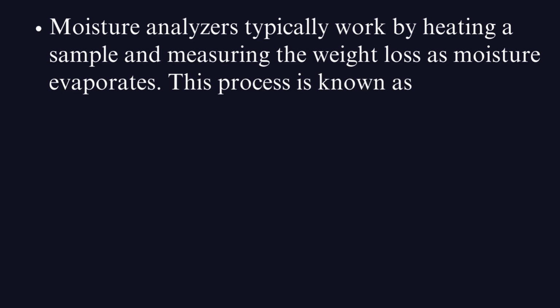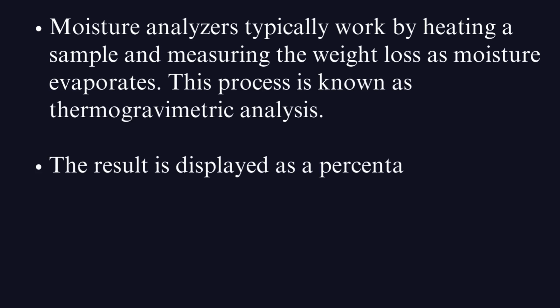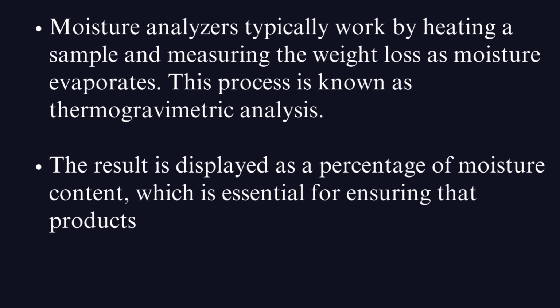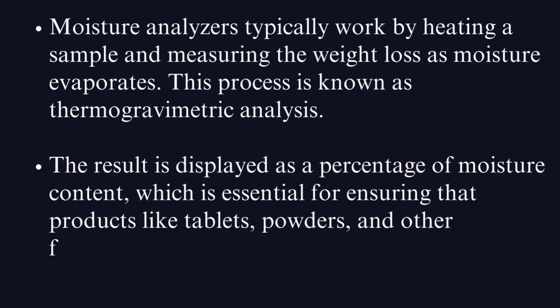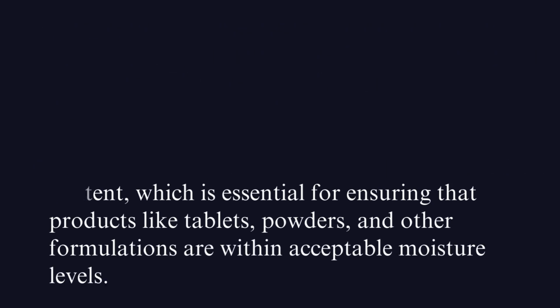This process is known as thermogravimetric analysis. The result is displayed as a percentage of moisture content, which is essential for ensuring that products like tablets, powders, and other formulations are within acceptable moisture levels.